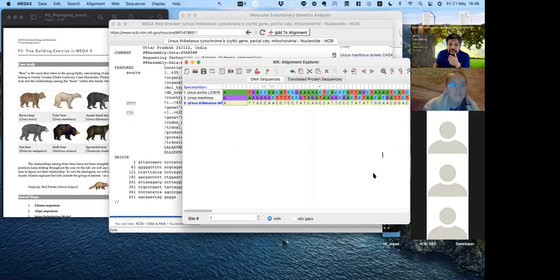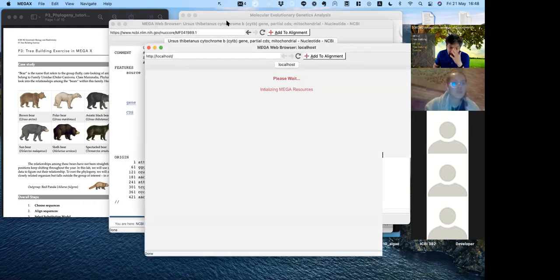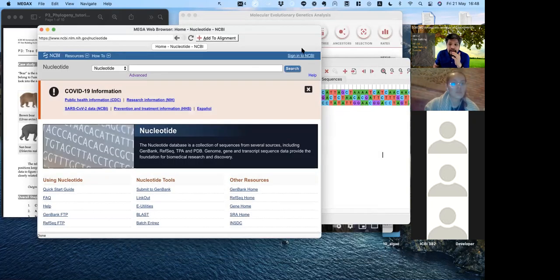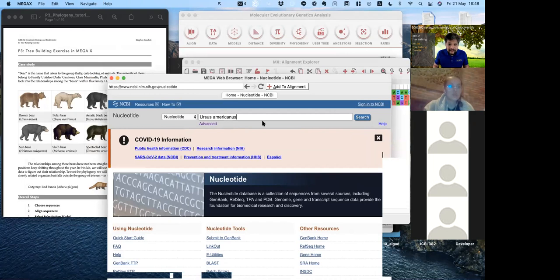Yep. But for most people, you'll find this pretty easy to use. Mega is just slow, and if you are used to something faster, you might feel a bit frustrated. But if you are comfortable with text files, I'll show you how it works next time. So we have slow. You can copy from my tutorial, cytochrome B.